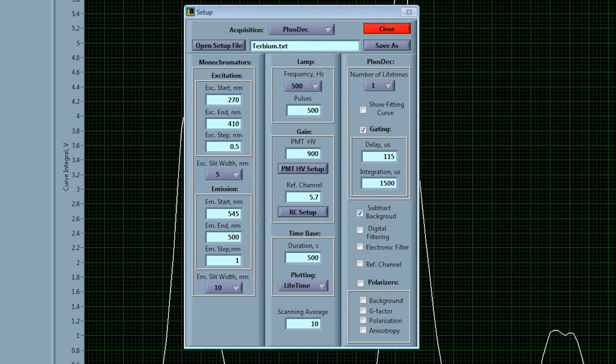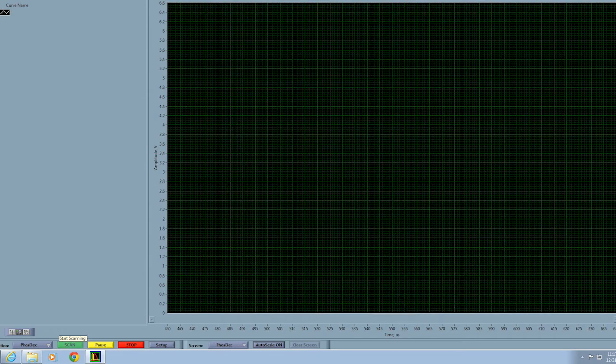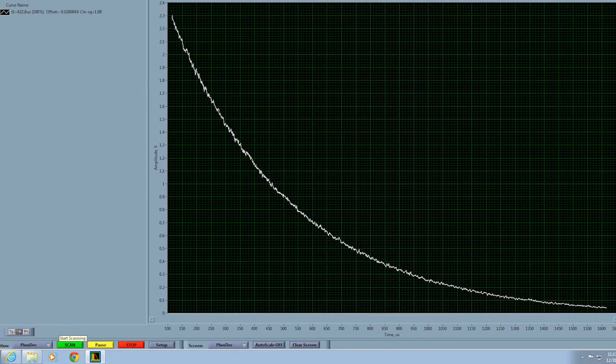So this acquisition time, the entire acquisition time, should only be one second. The rest of the parameters we're going to leave as they are and we just simply, having set that up, close this setup window and then simply hit scan and you can see that the system acquired that decay really quickly.